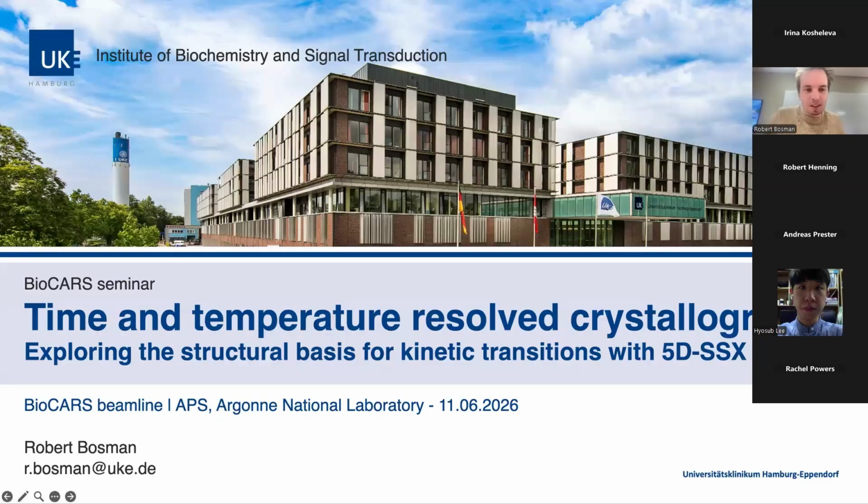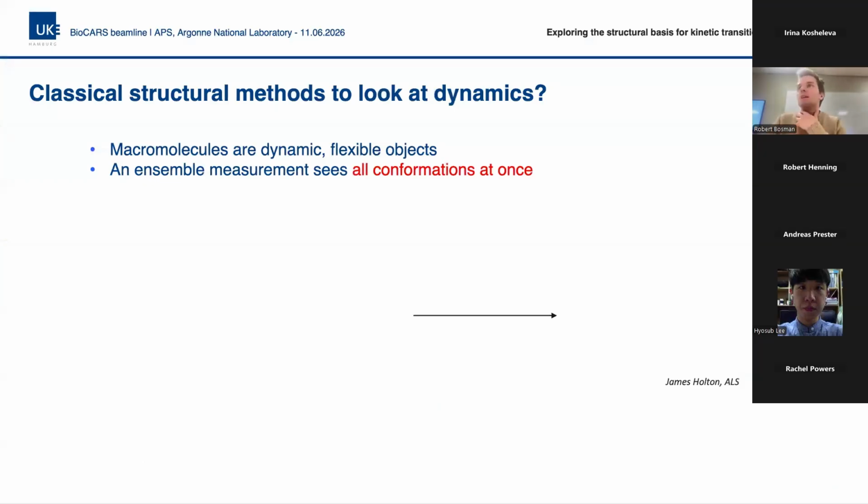So I will proceed on to the general topic today, which is how we are adapting, I should say, serial crystallography and time resolved serial crystallography, and doing it both with temperature and also in time to look at enzymatic studies. So I'll start by introducing.